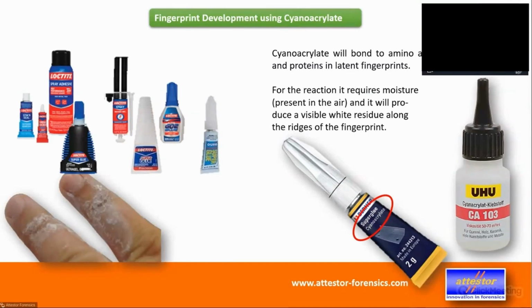And that happened 4 or 5 times till we found out, always when we were there, they were using our cyanoacrylate, and always when we were not there, one of the colleagues was using an industrial glue, and that industrial glue had a transparent marker mixed into it. So if you glue something black plastic material, you would not see this whitish bloom coming out. So there was a transparent marker, and obviously it made also the fingerprints transparent. No wonder you had no contrast on there.